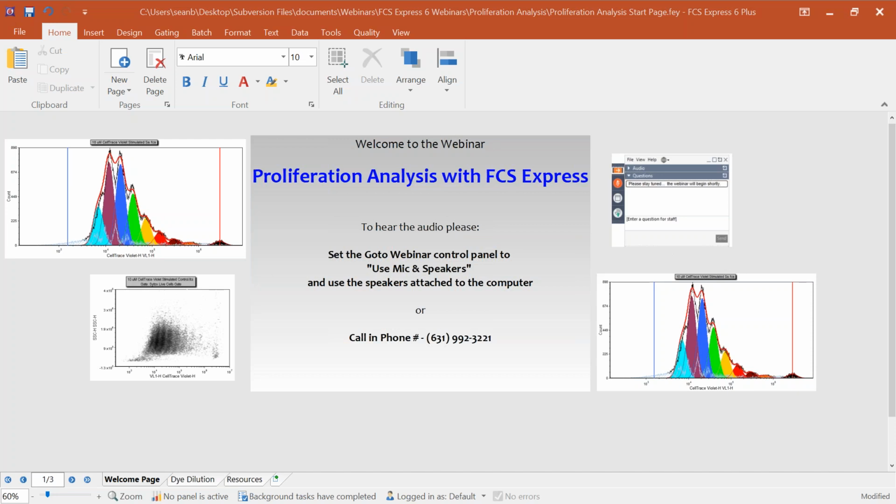Now, generally, fluorescent tracking dyes can be categorized into two major groups: general protein labeling dyes, such as CFSE, which act by forming random covalent bonds with amino groups on cellular proteins, which results in a highly fluorescent, membrane impermeable marker. And as you may know, CFSE is highly fluorescent and it's generally excited with a 488 nanometer laser. It's going to emit in the green channel somewhere around 515 nanometers.